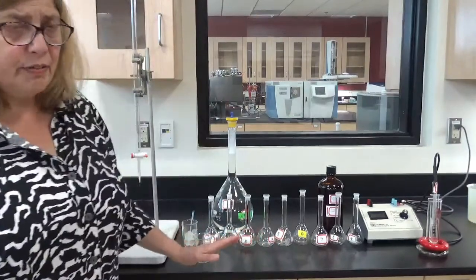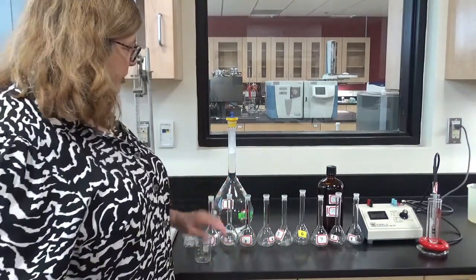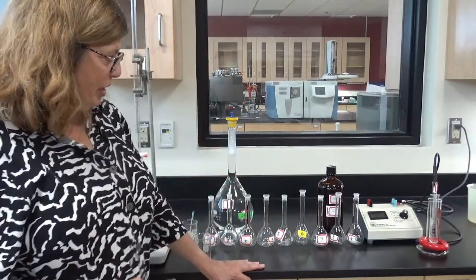So I'm going to be very careful. I'm going to rinse all my flasks here with deionized water. I made the solution in deionized water. I don't want any extraneous ions coming in from somewhere.